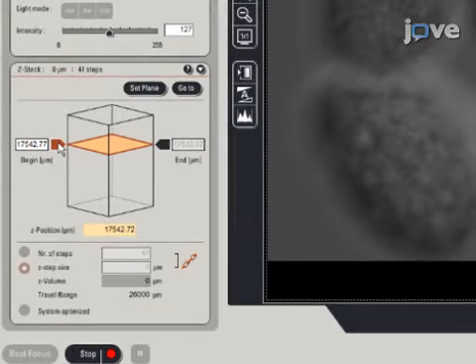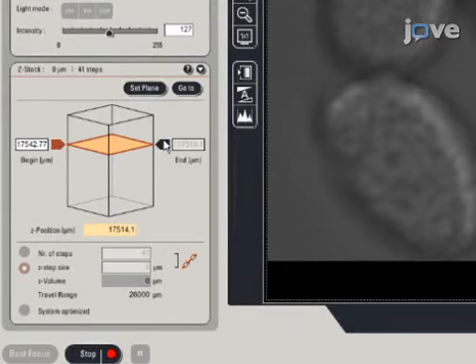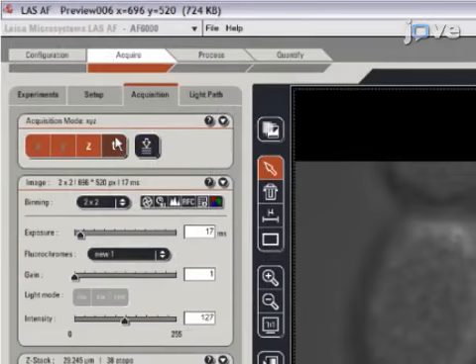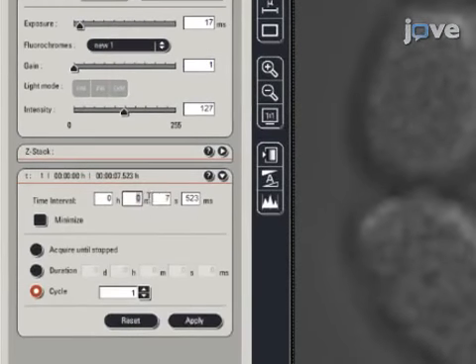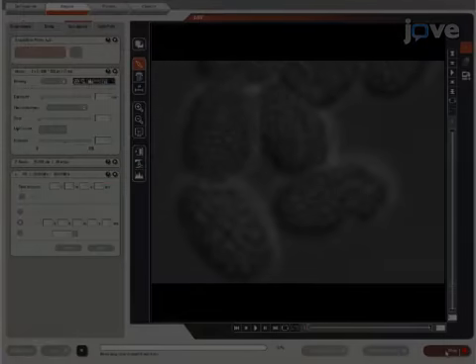Now, identify the top and bottom points of the embryos to record, and set the Z-stack parameters. Set the time-lapse to take images every 2 minutes. Make certain that the light shutter is closed between the image acquisitions. The time needed to capture the early elongation event can vary from 1 to 8 hours, depending on the stage of the embryo. Now, run the image acquisition program.